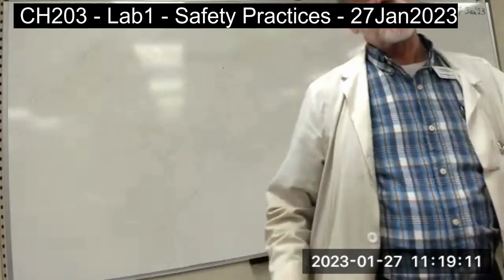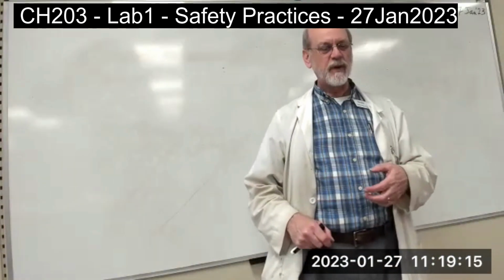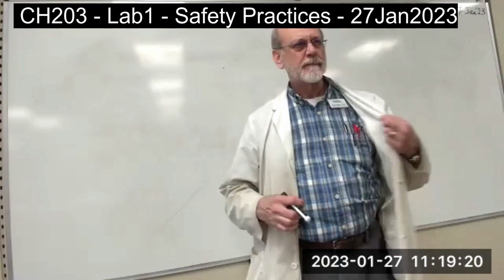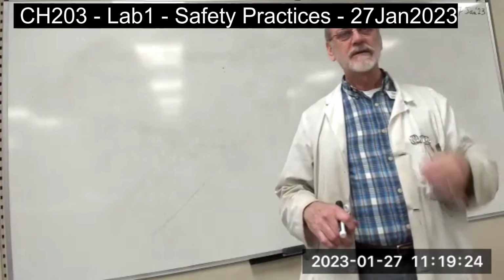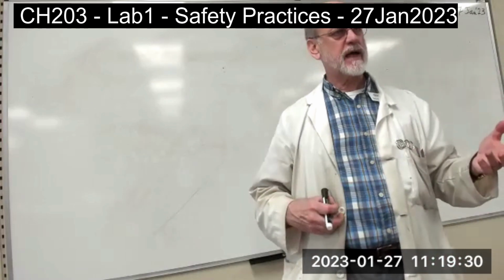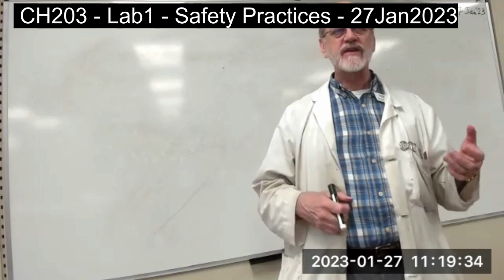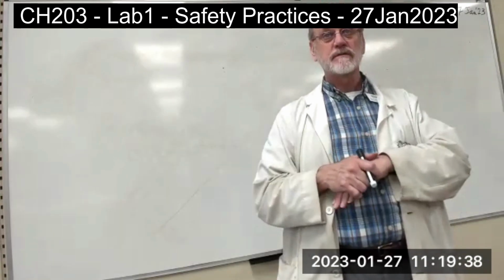And I suppose preparation includes preparing for what's going to happen in the lab. Safety precautions, like, are you going to be working with glassware? You need to at least protect your eyes. You're going to be working with hazardous materials like acids or bases. They can splash in your eye. Protect your eyes. Protect your hands.